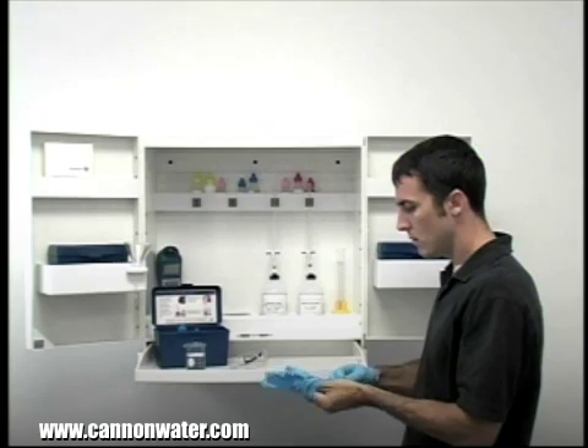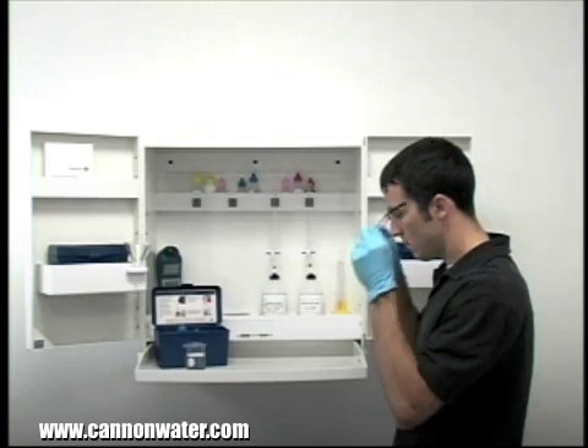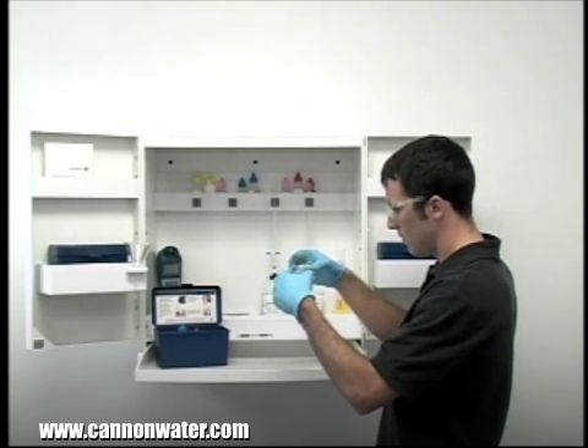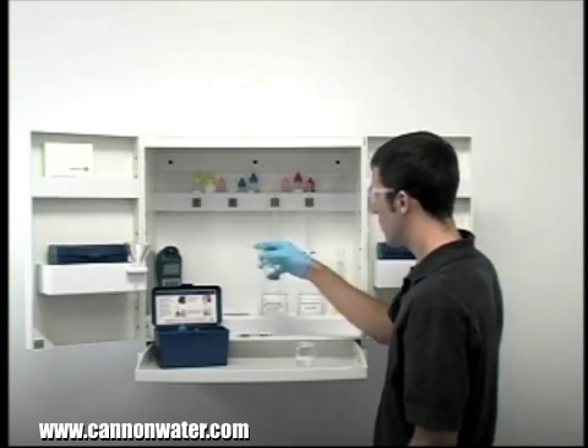The first step according to the endpoint ID procedure is to take an accurate sample. The smallest change in sample size will lead to inaccurate results. Before taking your sample, it's important to rinse the vial with the sample to be tested. This minimizes the chance of contamination from a previous titration.